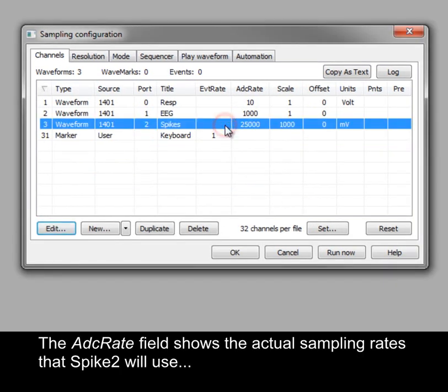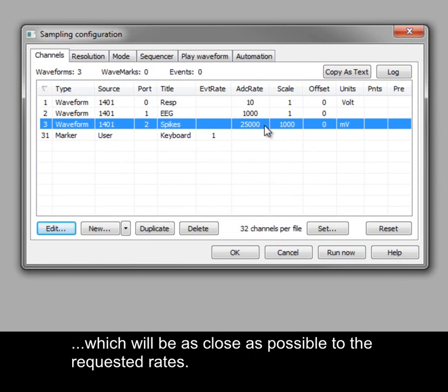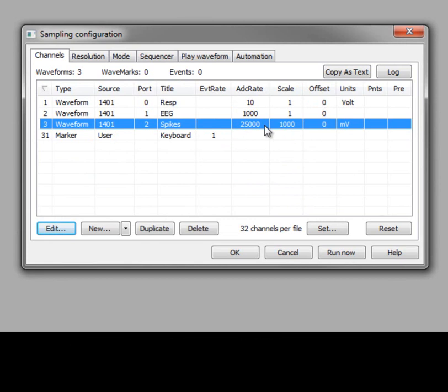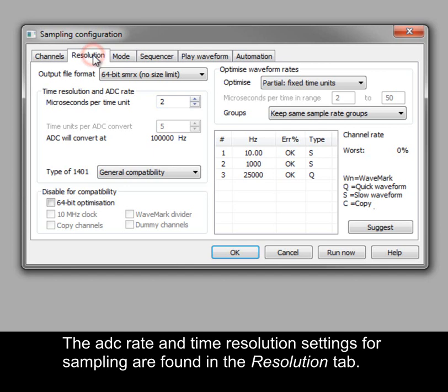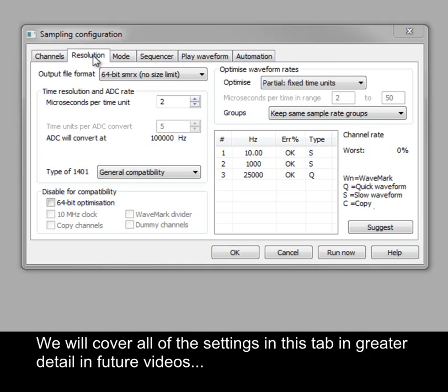The ADC rate field shows the actual sampling rates that Spike2 will use, which will be as close as possible to the requested rates. The ADC rate and time resolution settings for sampling are found in the Resolution tab. We will cover all of the settings in this tab in greater detail in future videos.